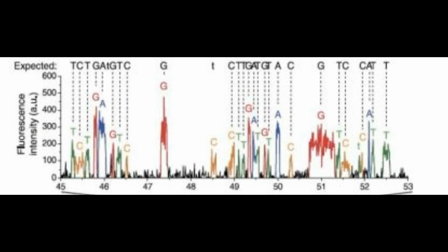The key advantages of using this technology are that we can sequence ultra long reads that can be from 3 to 4.5 kilobases on average and up to 20,000 bases. We can also sequence our DNA in a very short amount of time, and there is no amplification bias because there is no amplification required. We also have no problem with variant and modification detection because it can be done in the same run, and it is very cost efficient.